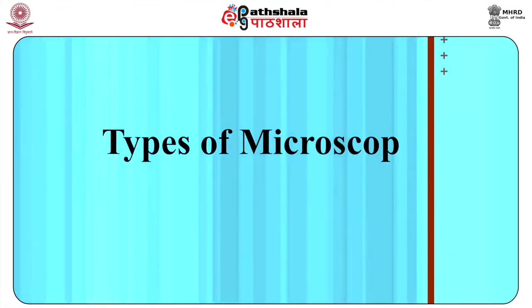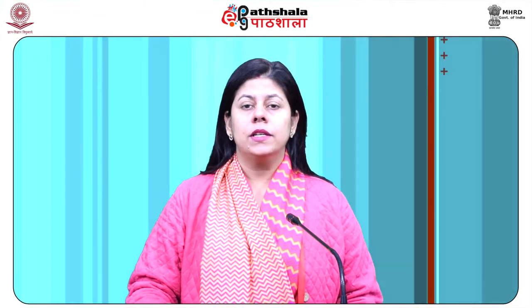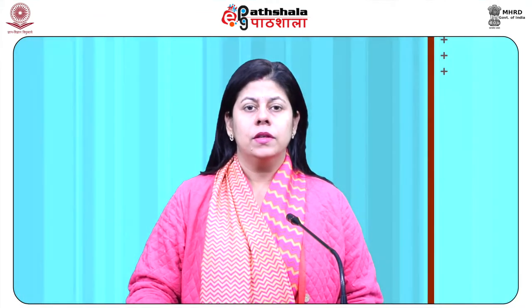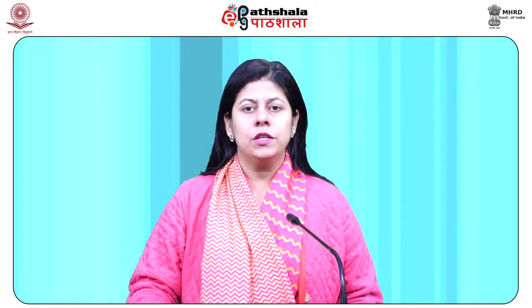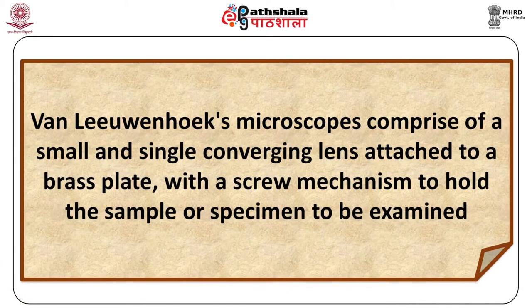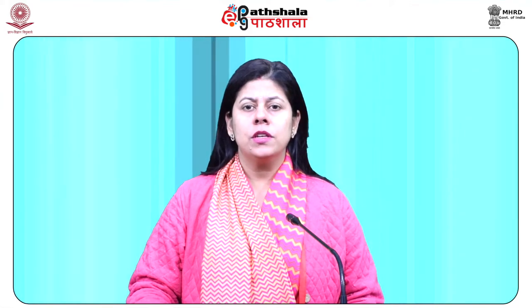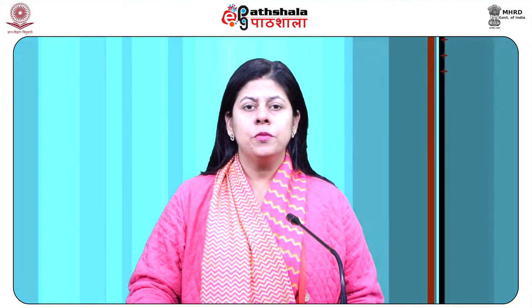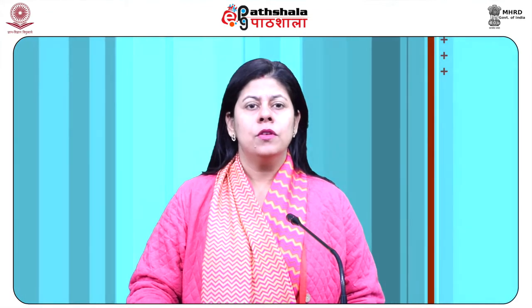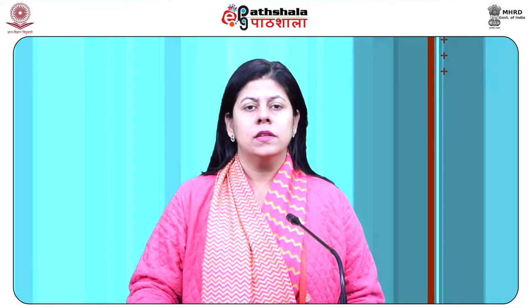Now we will see types of microscopes. Single lens simple microscope. A simple microscope is a microscope that uses only one lens for the magnification and is the original design of light microscope. Van Leeuwenhoek's microscope comprises a small single converging lens attached to a brass plate with a screw mechanism to hold the sample or specimen to be examined. Demonstrations by British microscopists have produced images from such basic instruments. Though now considered basic, the use of a single convex lens for viewing is still found in simple magnification devices such as the magnifying glass and the loupe.